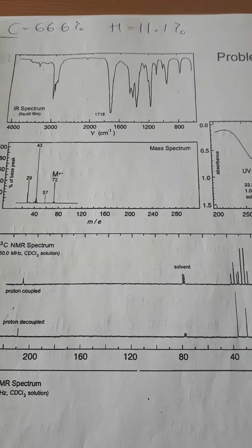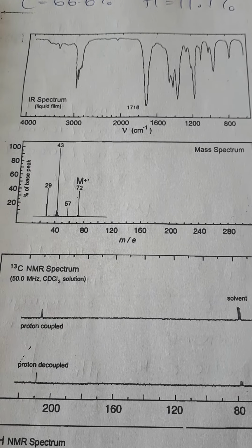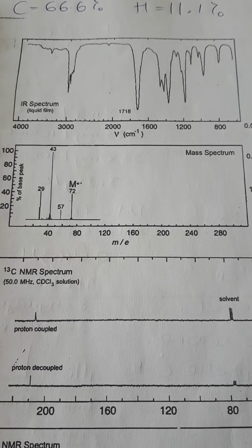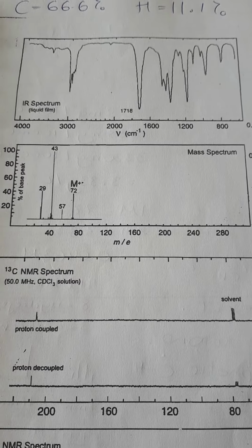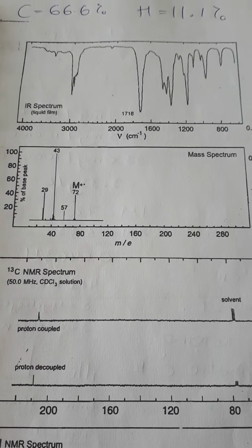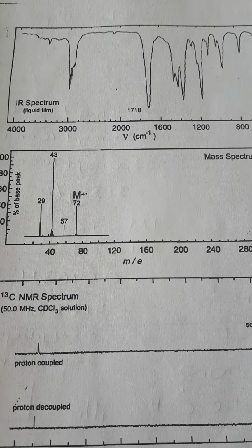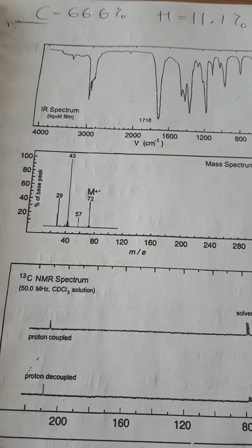Hi everyone, today we're going to look at mass spectra and how to interpret them. We briefly touched on this when I was going through the theory of mass spec earlier on this semester. And to be honest with you, this is probably the easiest type of spectra to interpret. So just to go through a few points.